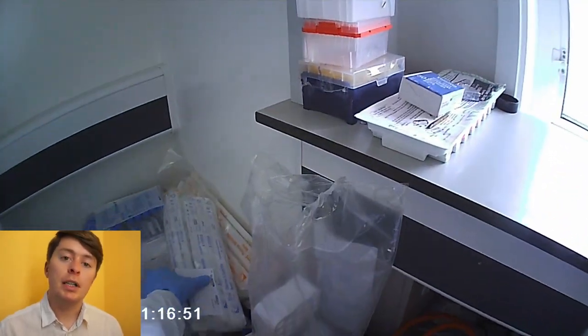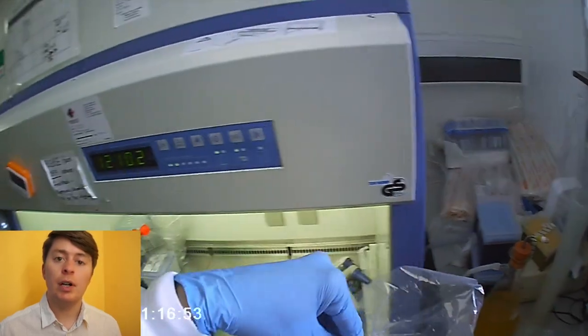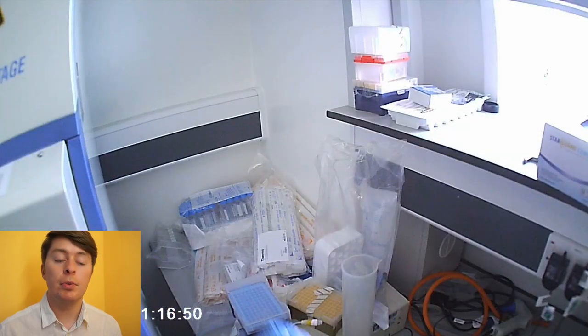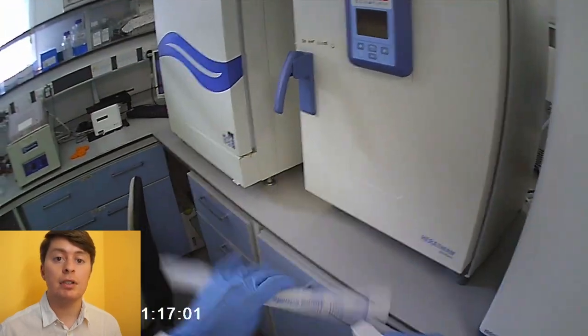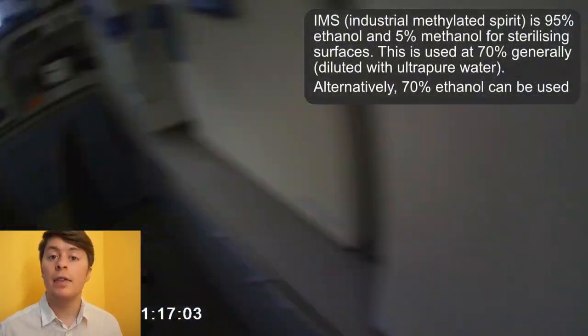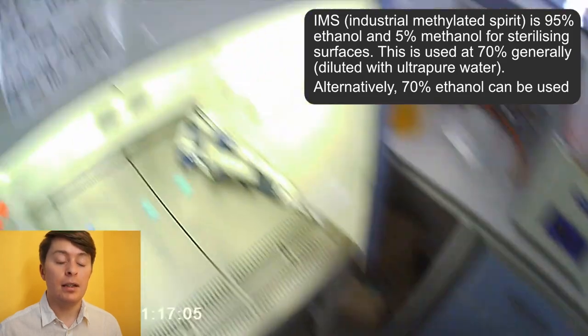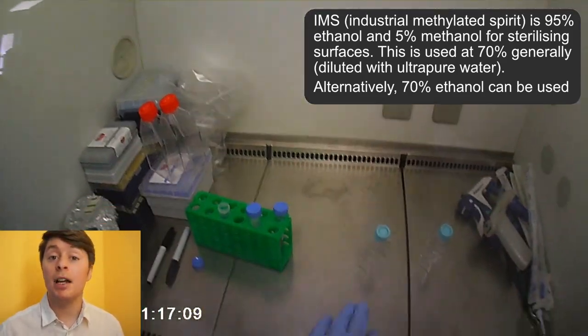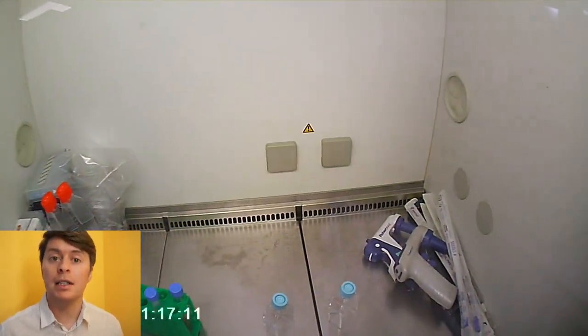So here, when we were working at the University of Kent, we kept a lot of our materials, a lot of our consumables down the side of the cell culture hood, which really isn't ideal, but as long as everything is kept within that sterile packaging before we open it, it should be fine in the cell culture hood as long as we spray it down with the IMS. And again, this is going to be a repeating theme in this video, that you need to spray everything with IMS before entering this cell culture hood.